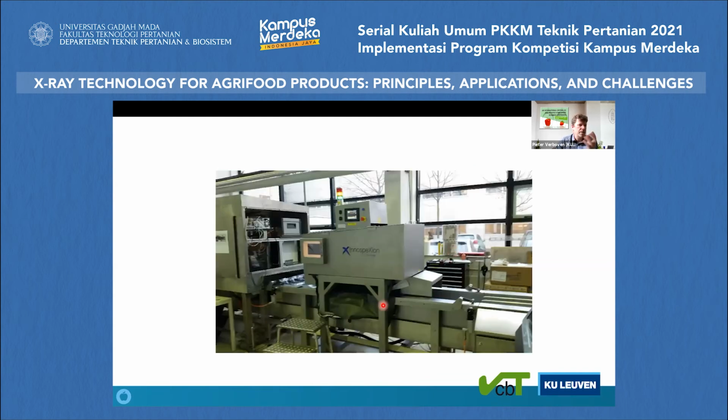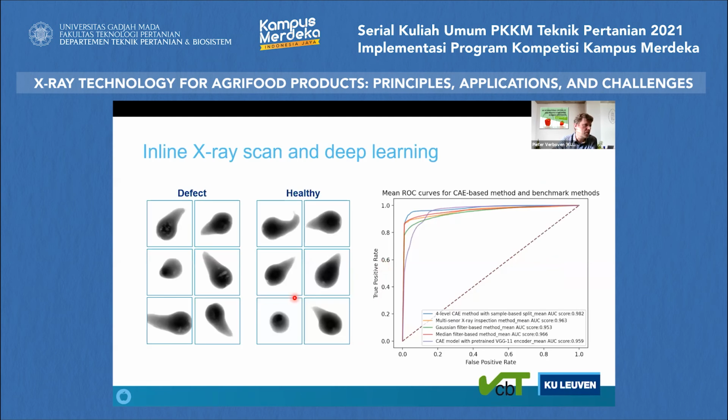You can also use conventional X-ray scanners that they use in airports, like Bayu introduced in the beginning, and see if you can use those. And we're also investing a lot in that method. You can make just normal X-ray images, not 3-dimensional images, but just projection images, radiographs, but at least you can image and you can see that defects are present in the image.